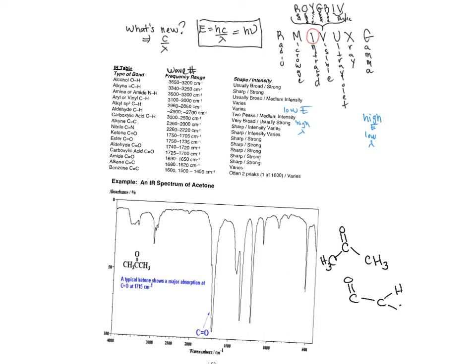I'm going to write every bond because that's the nature of what happens with the IR spectra. It comes from the fact that the energy that was absorbed by acetone then resulted in acetone stretching and bending those bonds, and the energy out detected by the spectrometer was able to resolve that there was an energy difference that correlated to the IR region. And then the detector ultimately transforms that information into a plot that we can visualize. Now, I'm not going to be interested. Your book will show you lots of information about how it actually works for your own interest, mechanically speaking.